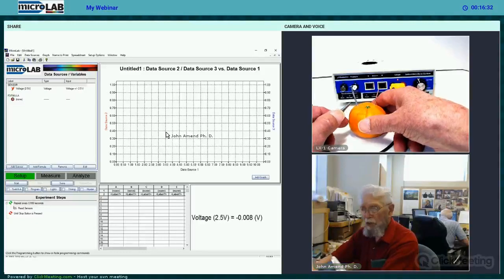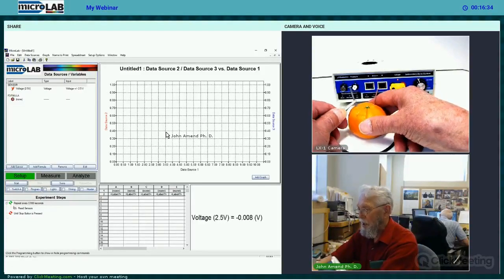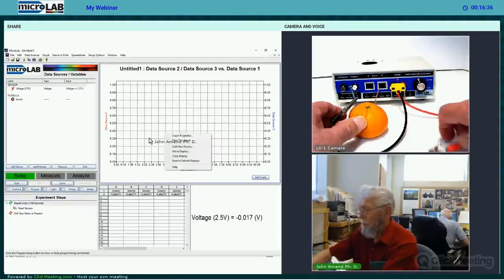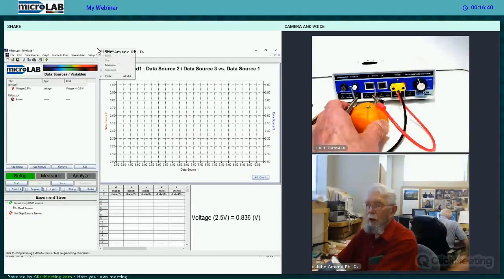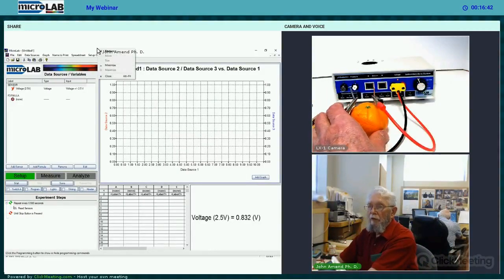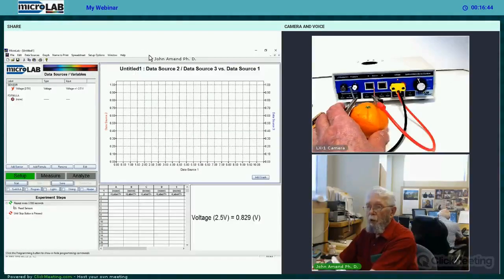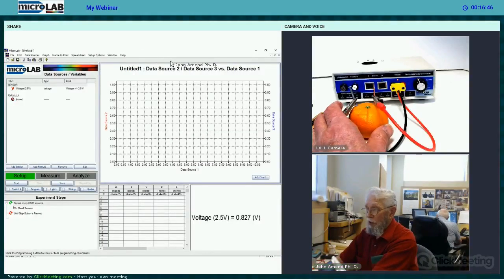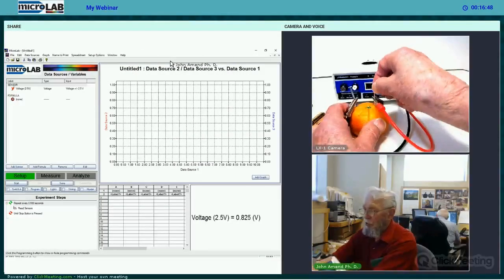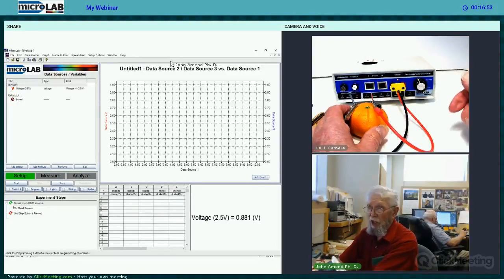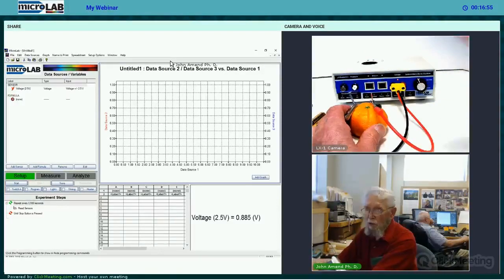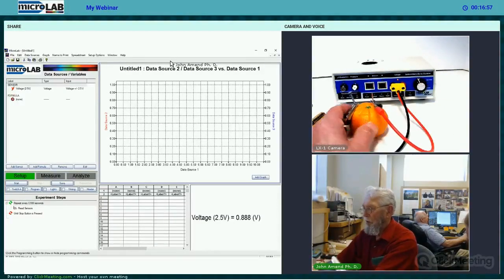But will also produce a voltage. What do you think? More? Less voltage? Any voltage at all? Let's take a look. And there we have a voltage. 0.828 volts at this moment. Does it change if we move the electrodes a little bit? Maybe. Maybe not. Doesn't seem to change very much. Same order that we saw with the other one.